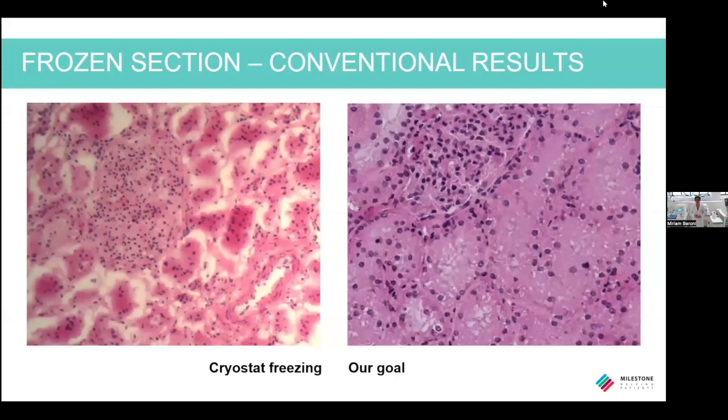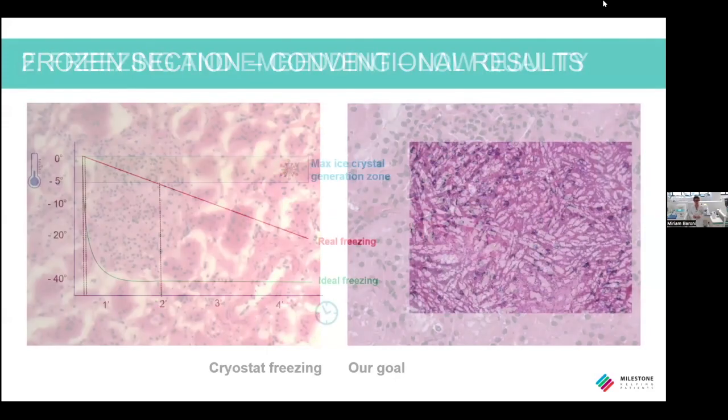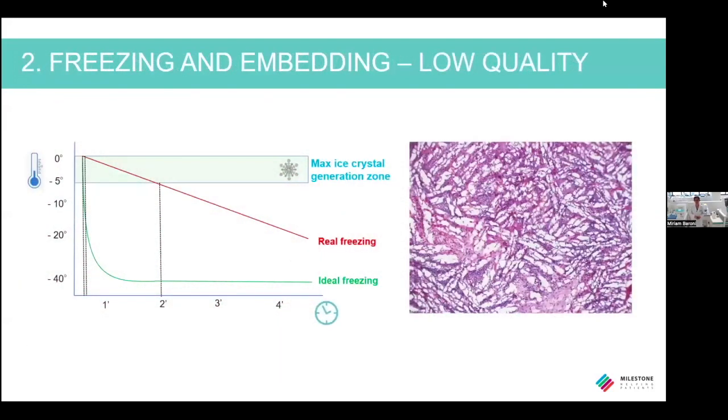My goal today is to achieve a quality like in the image on the right. The main problem during the freezing of a sample is the formation of ice crystals that lowers the quality, destroying or damaging the structure of the sample and modifying the morphology of the tissue.